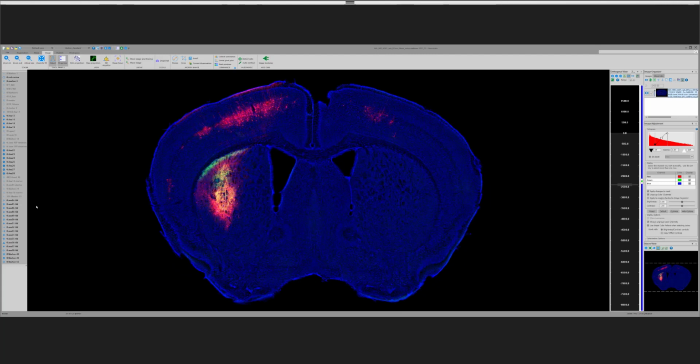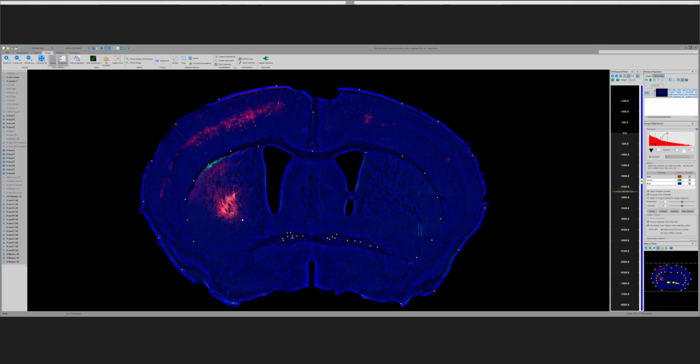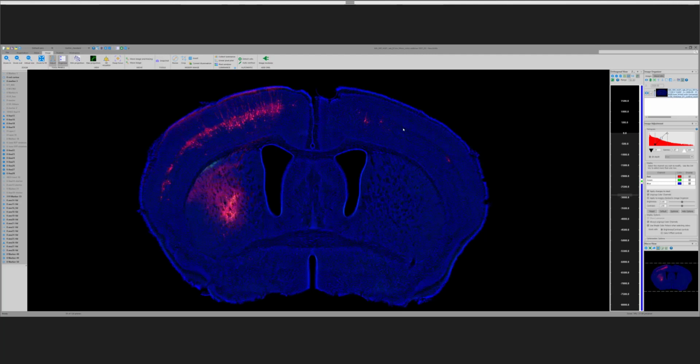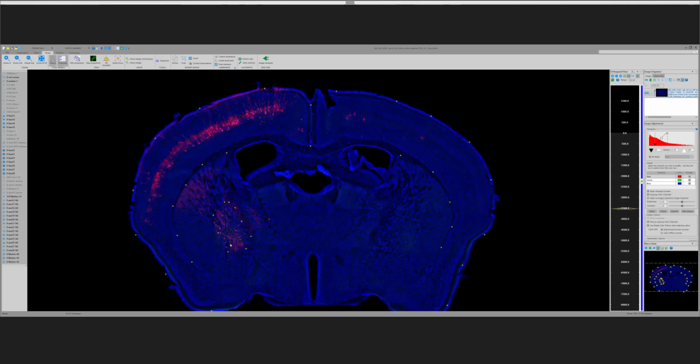The other thing we wanted to do was to put fiducial markers into this brain. These are yellow markers that I laid down on fiber tracts, the corpus callosum, the outside of the cortex, the anterior commissure, things like this. After we do the registration, we can see how accurate the registration of these sections is to the Allen space. It's not actually using them to do the registration. They're there to see, once they're transformed into the Allen space, how accurate a job we did.